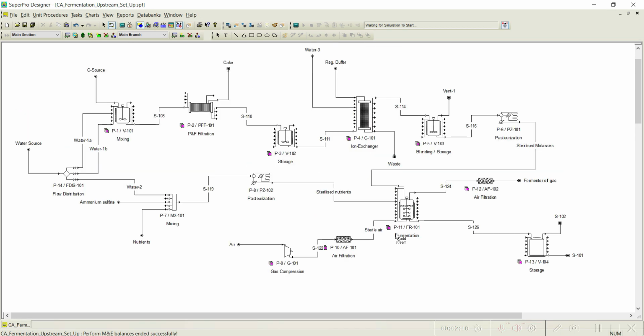Now you can notice a lot of these boxes have appeared. The new symbol appeared. It shows multiple units. So let us see later how to reduce them, or how to remove these particular symbols, and what these symbols are. All these things we will look into later.